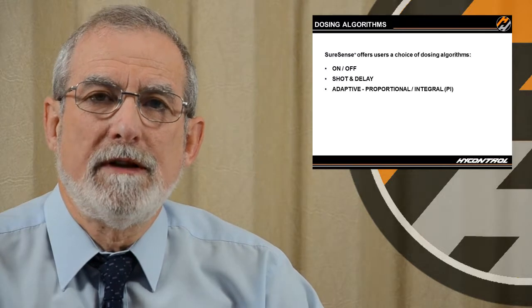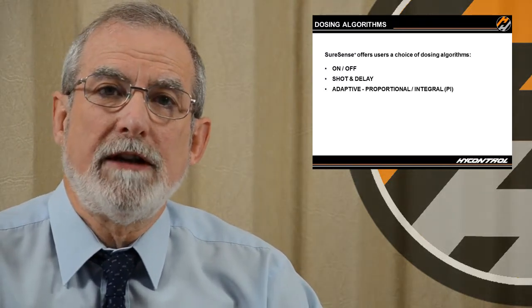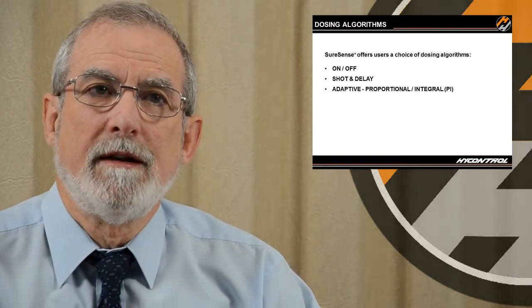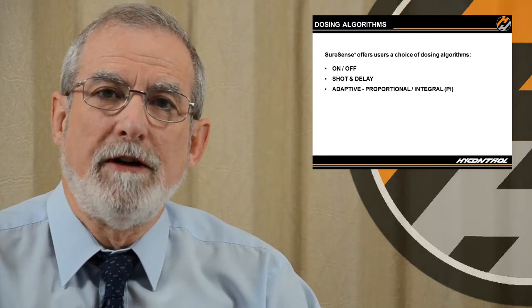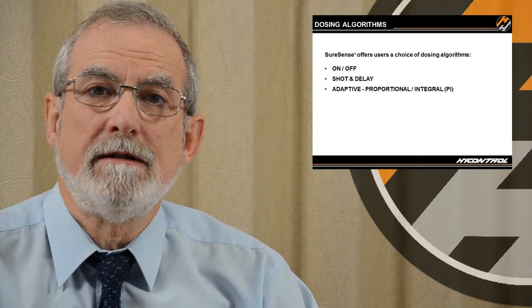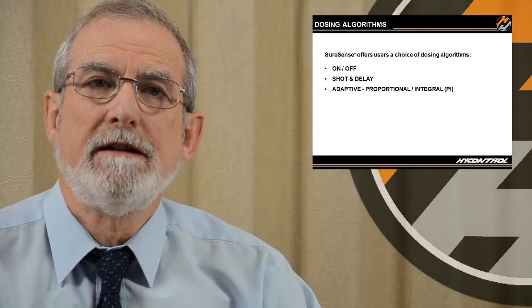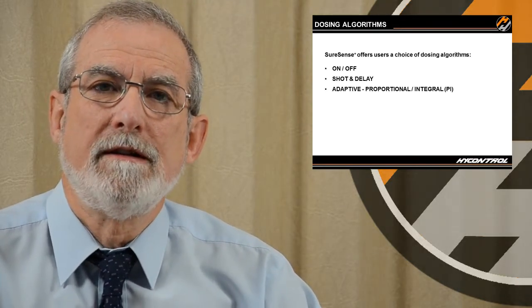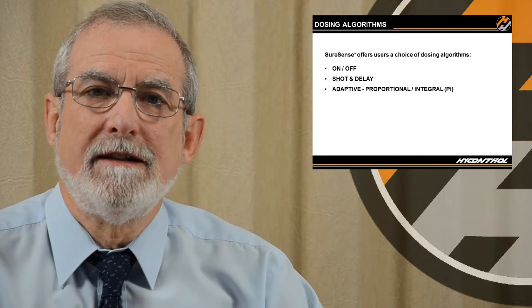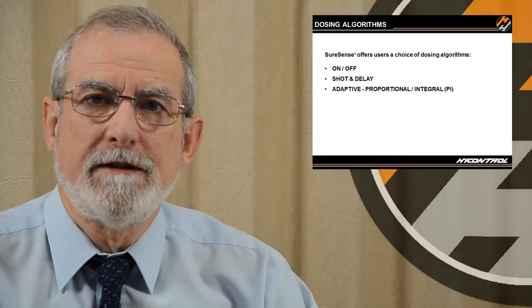As the foam comes down, subsides because of the antifoam, and the error comes down to 0, the proportional term will come to 0, the integral term will stay where it is, it will stay as high as it's reached. Keep the pump running slowly to balance out the effect of the new foam being created at the liquid surface.